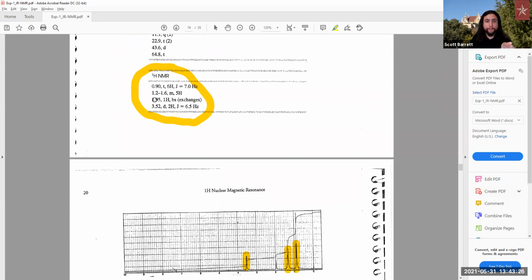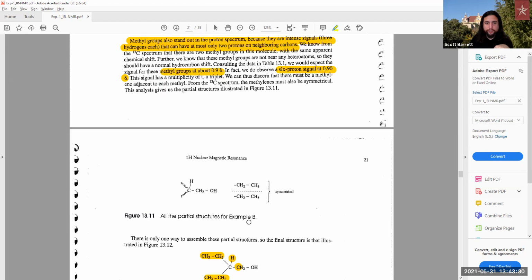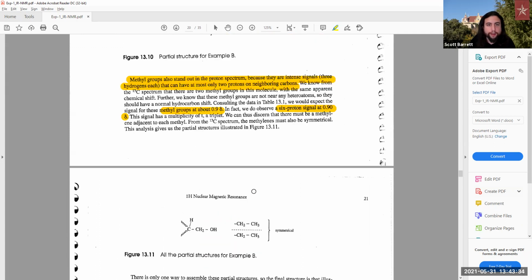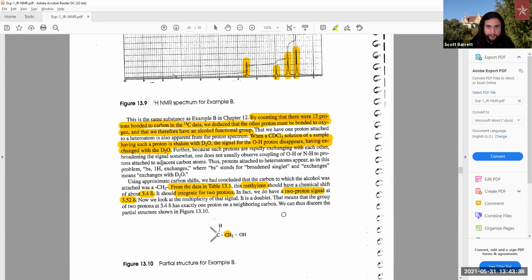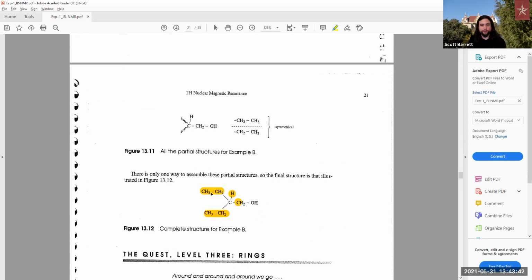And then finally, you have your 1 hydrogen here at 1.9. I think that would have to be the alcohol, because they're not clarifying that from the data. But regardless, the main thing we can take from here is the other groups: the 2-2-1 making 5, the 3-3 making 6, and then this methylene giving the 2.